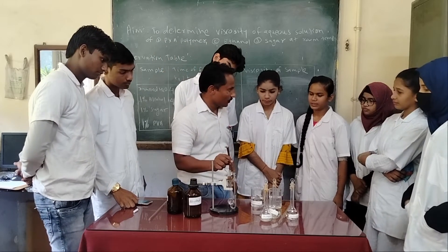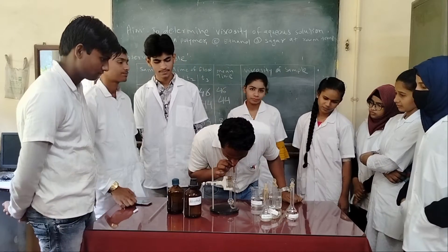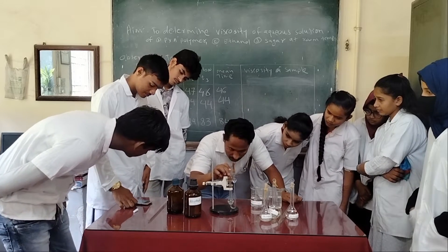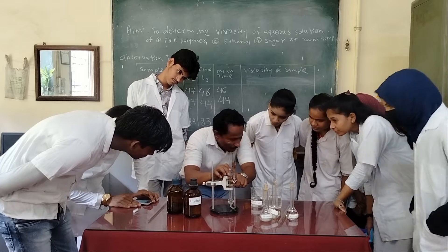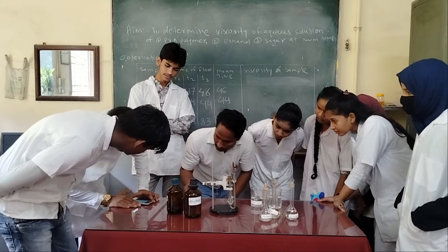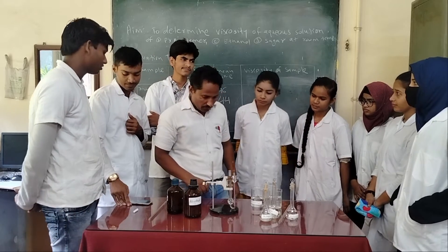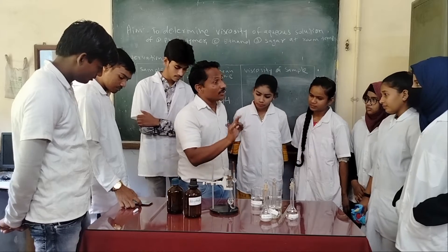The solutions will flow from the rubber bulb. From this rubber bulb we will push the solution up. Make the stopwatch ready — is it zero? Don't start yet. Just wait. When the liquid comes to the upper margin, you can start. Upper margin — when the liquid reaches the upper margin, release the rubber bulb and start the stopwatch. The liquid will flow from the upper margin to the lower margin through the uniform, thin capillary.